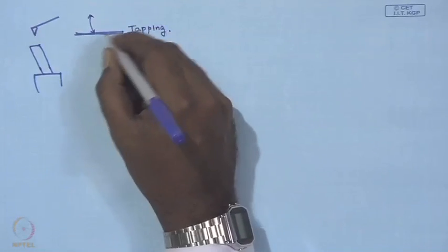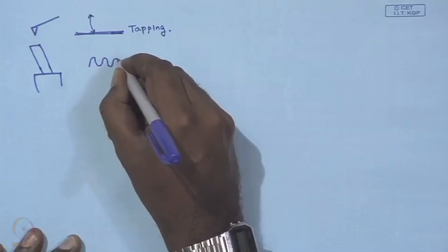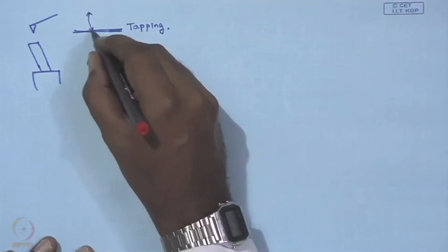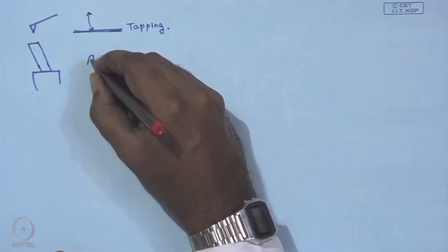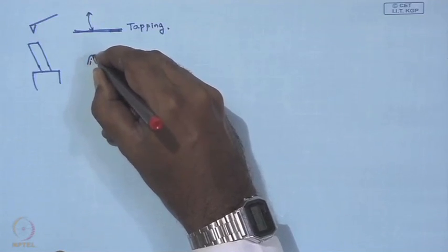Now, depending on the adhesiveness, this is, let us say, the input pulse that is oscillating the cantilever. Depending on the extent of local adhesion, there might be a time delay or a phase lag between the input signal and output signal.